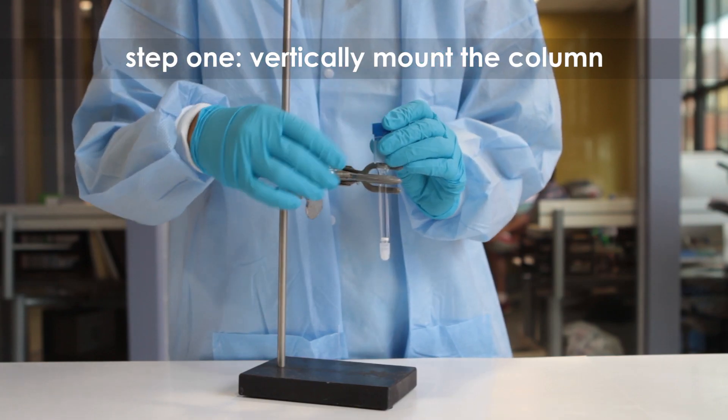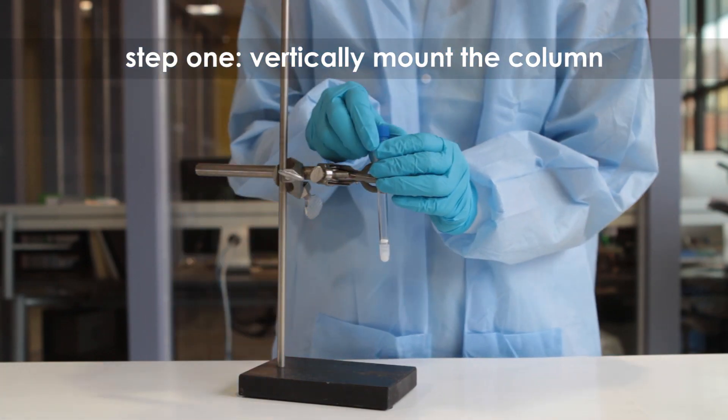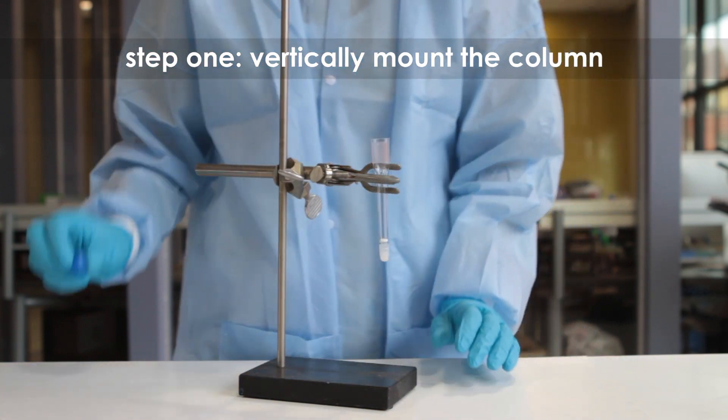Step 1: Vertically mount the column on a ring stand, making sure that it is straight. Keep the bottom cap in place on the column.